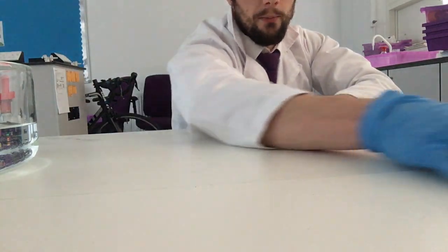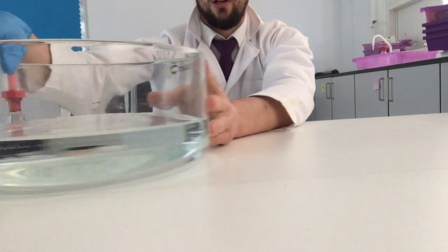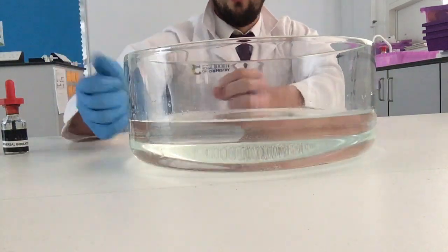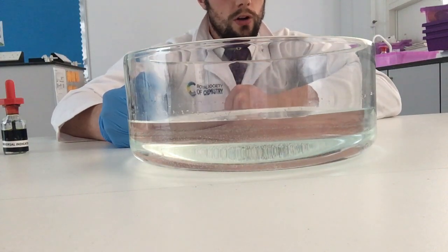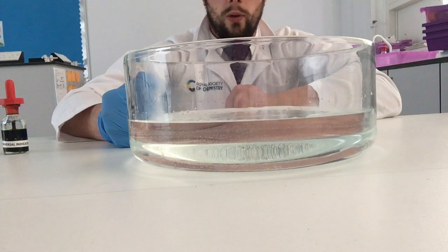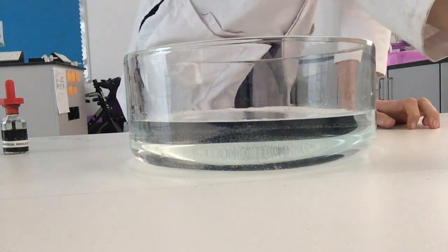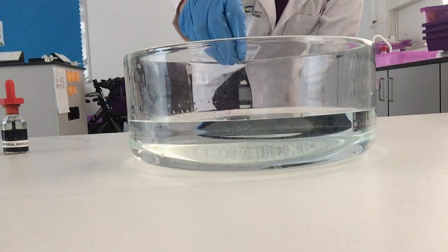Now I'm going to show you another chemical property which we looked at briefly last lesson, is their reactions with water. So alkali metals are very reactive. When they react with water, they lose their electron, it's transferred to the water to make a hydroxide anion, and we're going to release a lot of energy. So first, let's take that sodium that I was just using, and I'm going to put my bits of sodium in the water. Let's see the reaction.